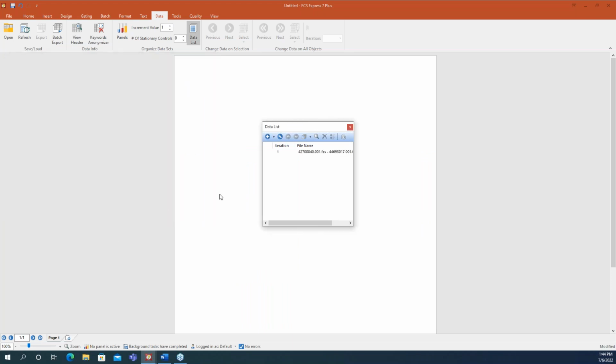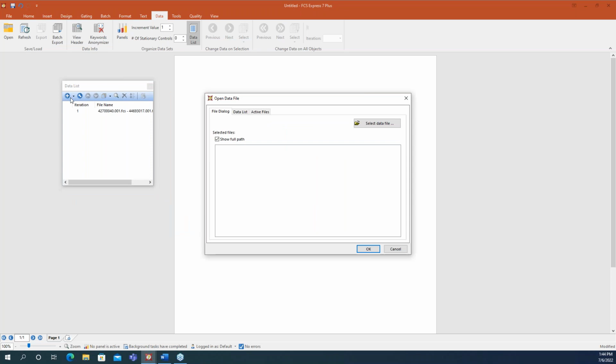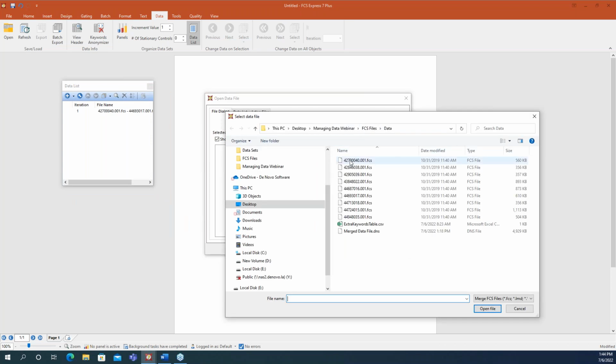And click OK. Oops, I actually brought it in merged. I'll do that again here. But that was a great question. Thank you so much, James.